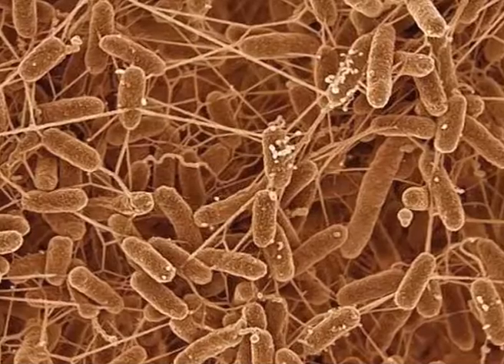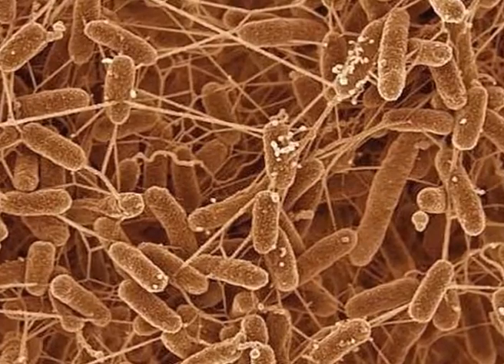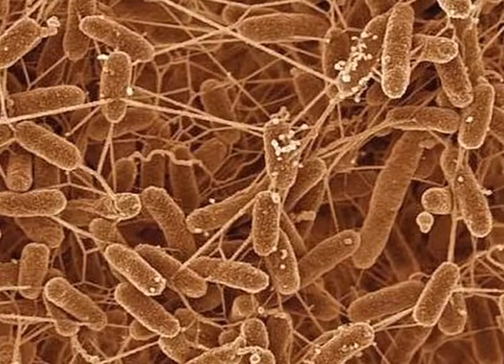All microbes have definite temperature requirements for their growth. If we exceed that temperature, it becomes difficult for them to survive.